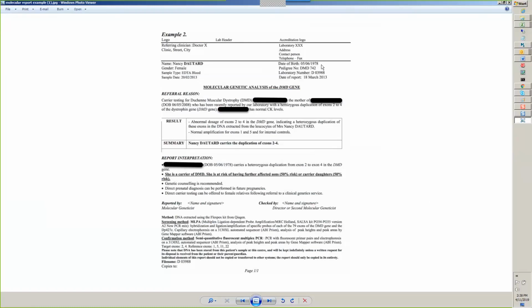However, identifying numbers like the patient ID, the universal patient ID, the specimen number, a block number, a surgical path number, all of these could be on here, and indeed we encourage sites to put a spare specimen label on the report so that it very clearly is associated with the particular specimen.